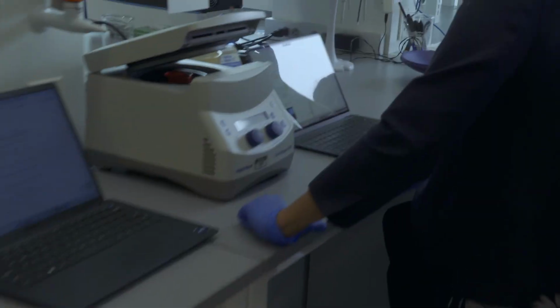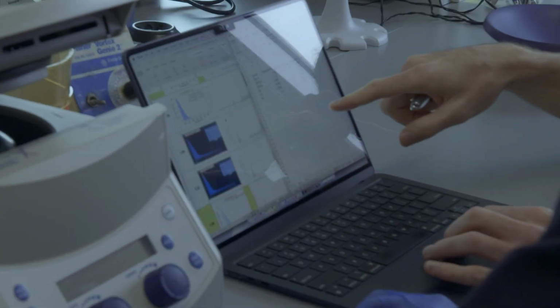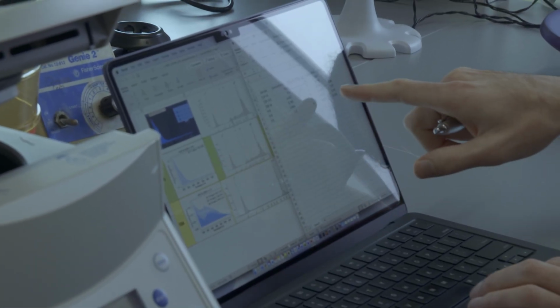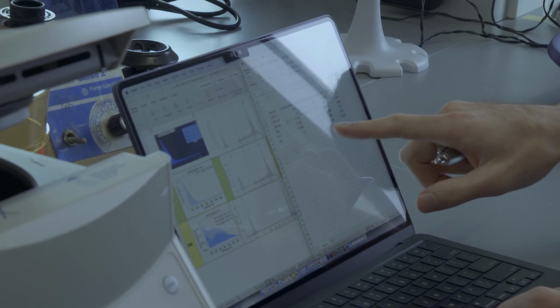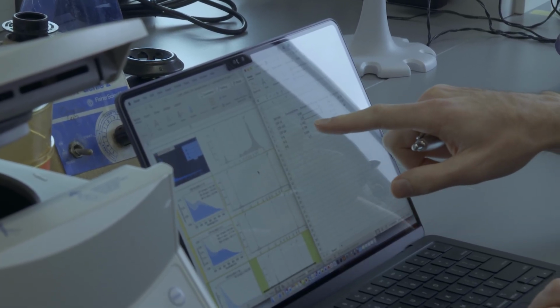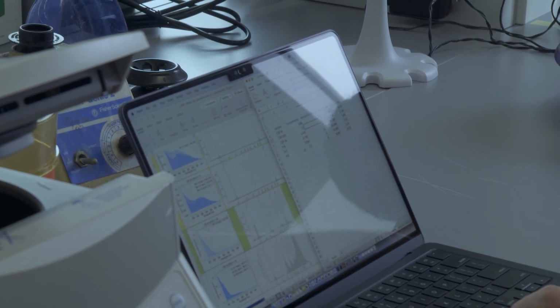Rather arbitrary, but that's fine. Two, which has some more contamination, we would do half, so 8. And this 4 is the highest we can go just because of the limitation of starting concentration. Okay, that's fine. And this is 10.